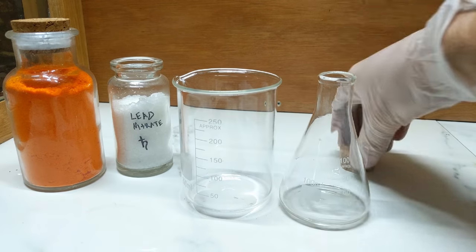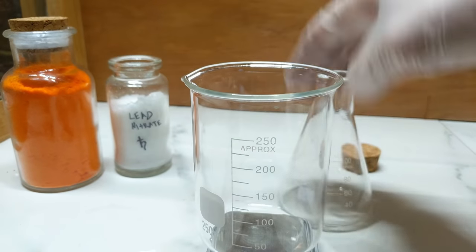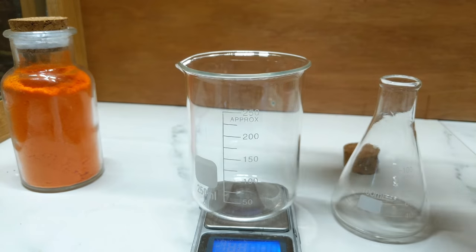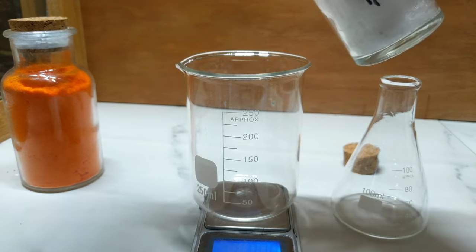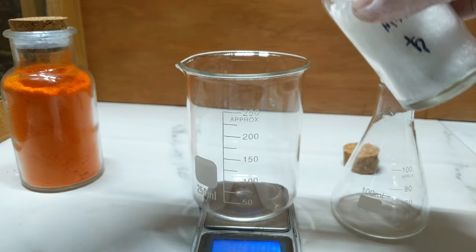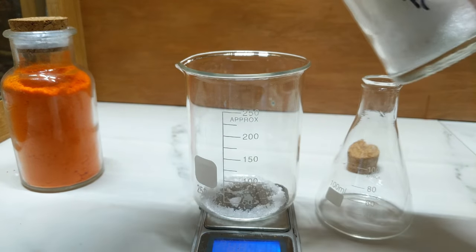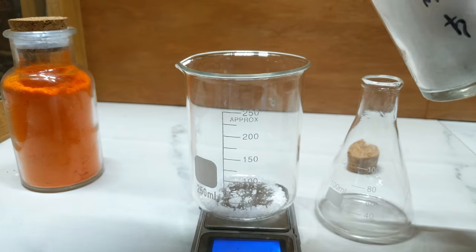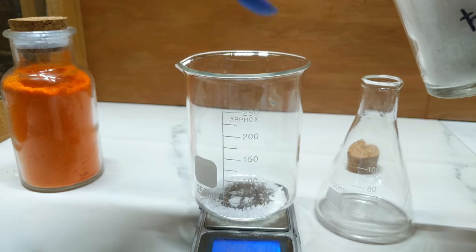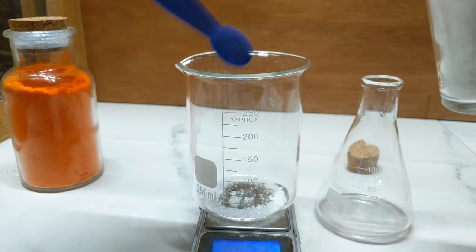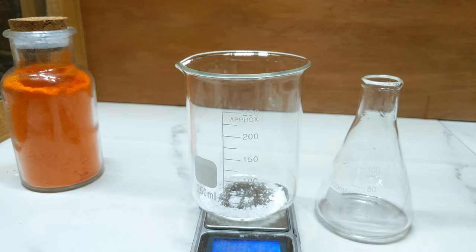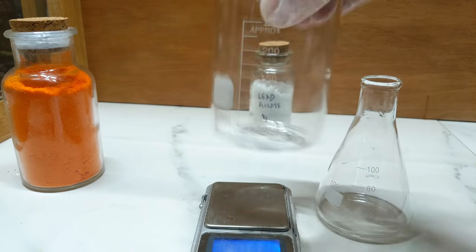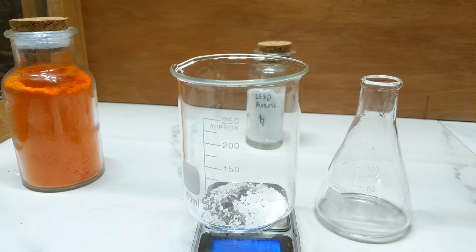We're going to take, so we just have on the scales here, we'll be putting five grams of lead nitrate crystals. Lead being very heavy, it doesn't take much to get to five grams. That already, as you can see there, that very small amount is five grams.